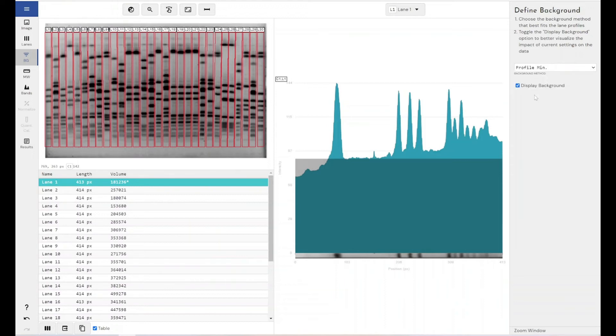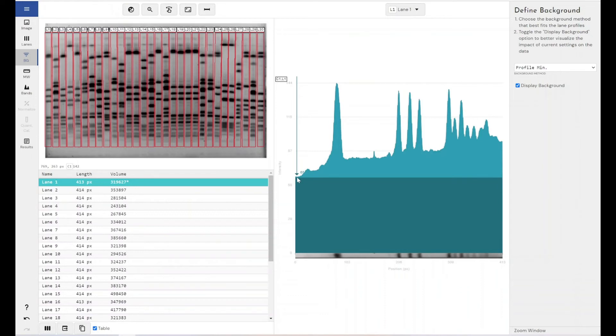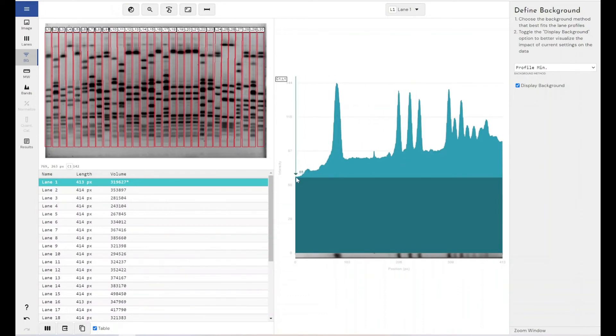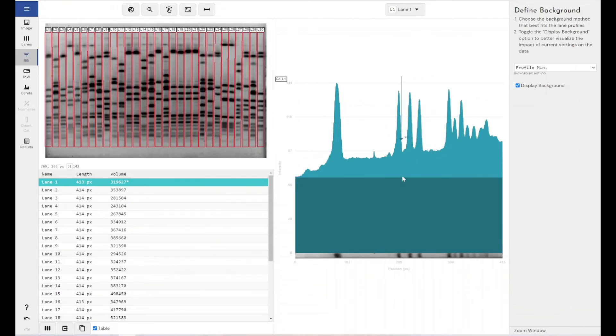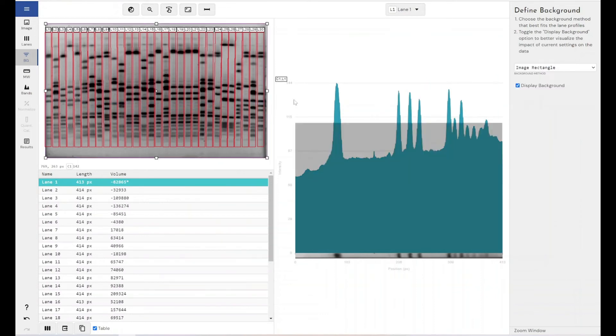We've got the ability to select the profile minimum value as the background removal method, which literally just takes the lowest point of the lane, not always the starting point of the lane, but whatever the lowest value is along the lane length, it would set the background there.